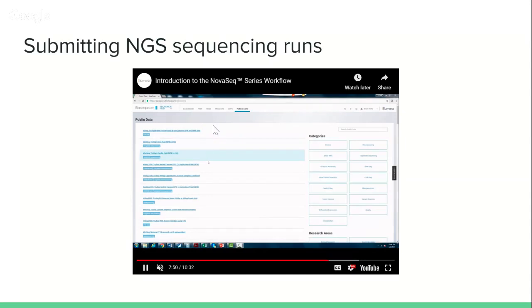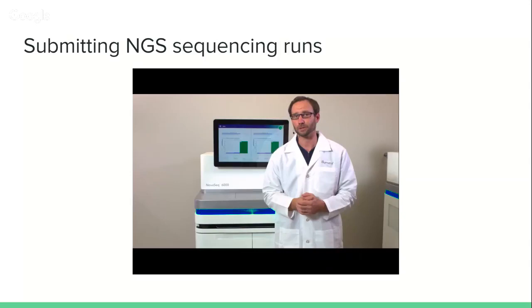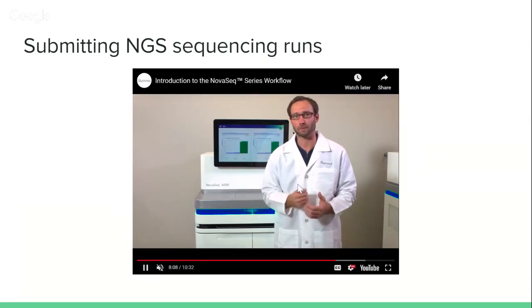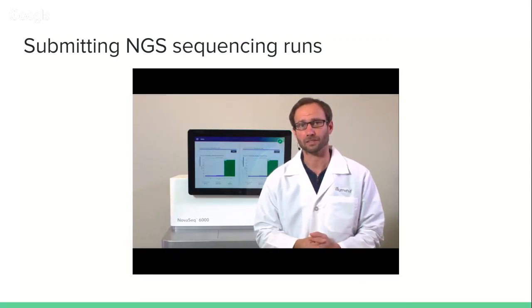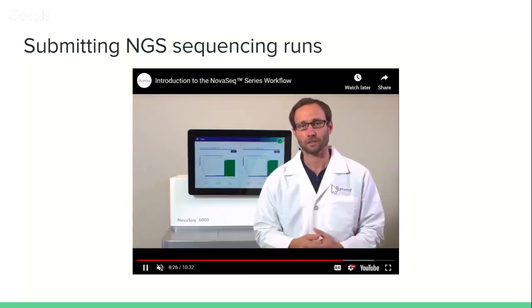Illumina also allows you to run pre-configured bioinformatics workflows and then do correlations of your multi-sample analysis to reference data sets. I'm going to talk about the primary and secondary tertiary analysis of bioinformatics in the next slides, and I'm not going to talk about it in the context of BaseSpace, but BaseSpace is an option. For other companies like Oxford Nanopore, they also have the Epi2Me offering, which basically connects the sequencing to the next step, has specialized apps and workflows to run things automatically after sequencing.